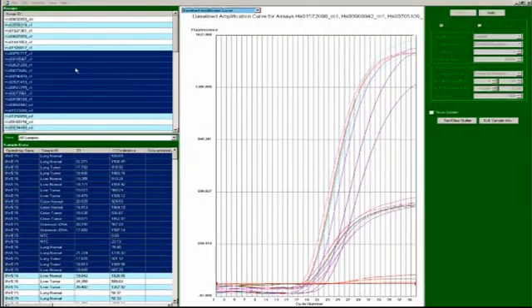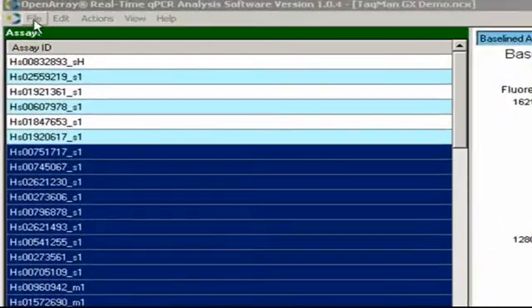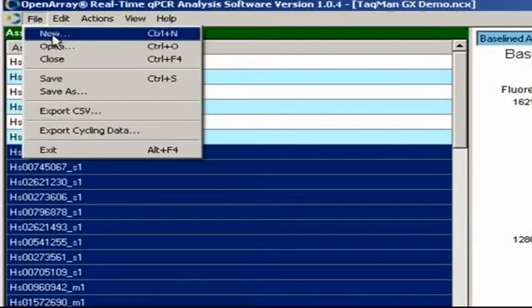Finally, let's see how to export data from the OpenArray run. Just go to File, Export CSV.